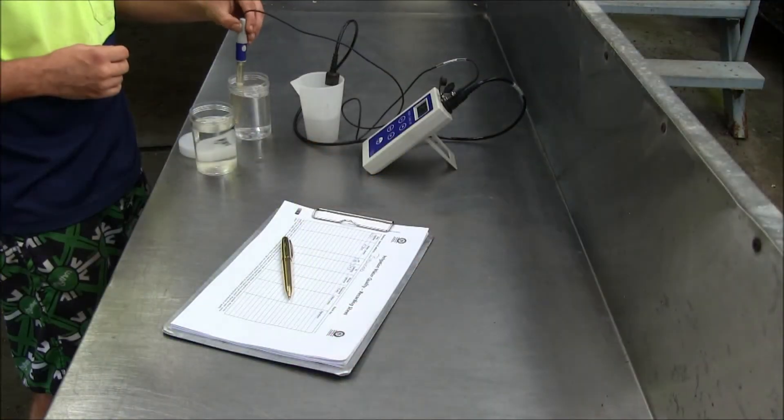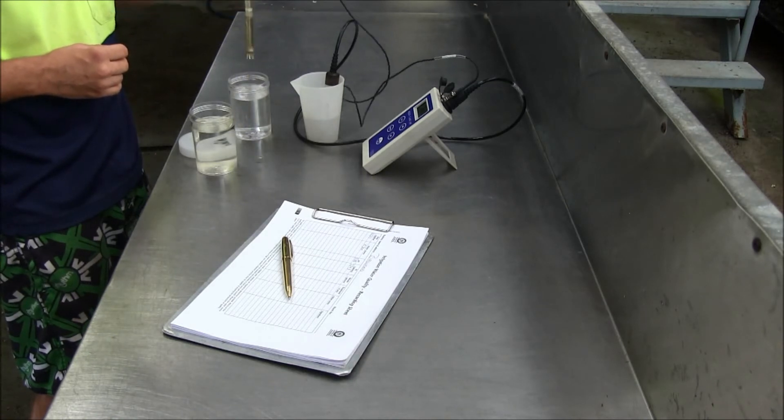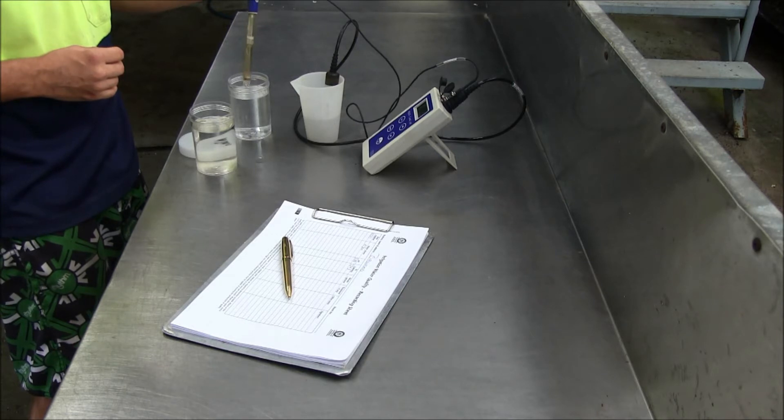Before testing the next sample, rinse the probes in the distilled water and carefully shake off excess water to make sure the samples aren't contaminated.